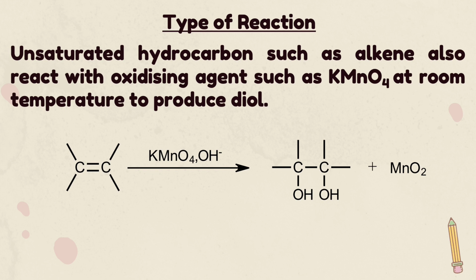Sebab apa? Sebab kebanyakan hydrocarbon ni, warna dia, order dia semua sama je. Warna dia semua colourless. Order dia semua macam bau petrol je, sebab dia adalah hydrocarbon. So kalau saya ada satu botol deep many type of hydrocarbon yang saya tak label, dia macam air kosong je. So kita akan buat chemical test to determine whether dia saturated ataupun unsaturated.